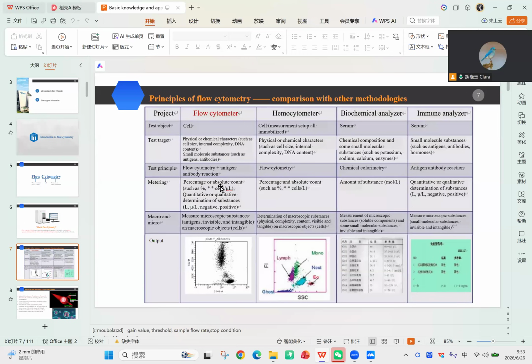But for the flow cytometer, we have a step or a procedure outside the flow cytometer. Outside the flow cytometer, we have to stain the cells. What do we use to stain the cells? One is fluorescence, just like dyes. And another one is antibodies. So what are antibodies? It's like a key that specifically binds to the lock. The lock is expressed on the cells.